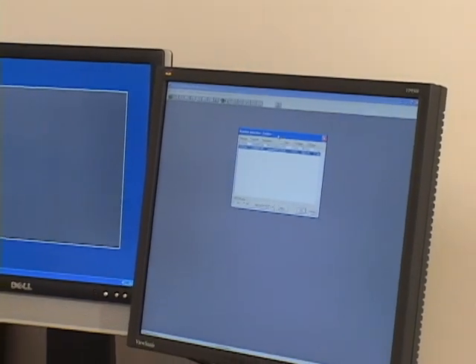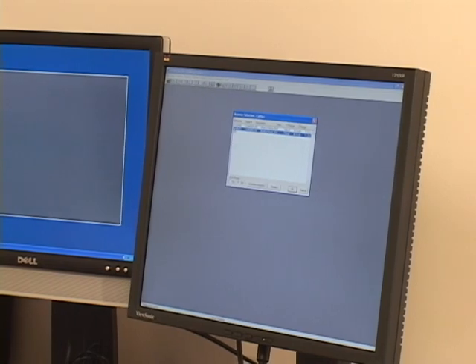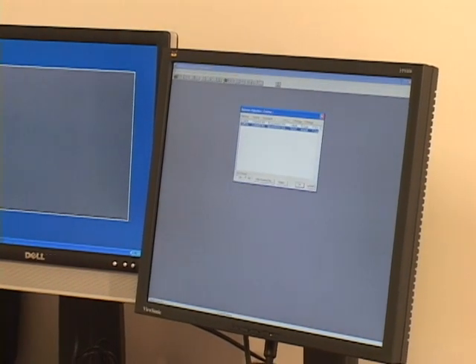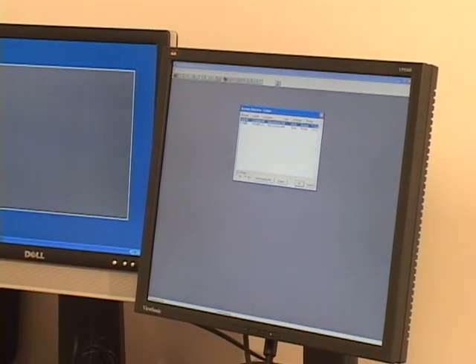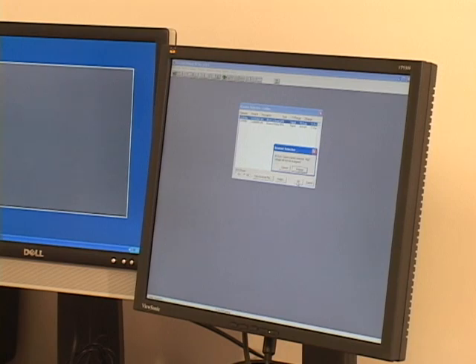And now you have a scanner selection window. First thing you want to do is select the CASW lin file, which is the software linearized file, and click OK.